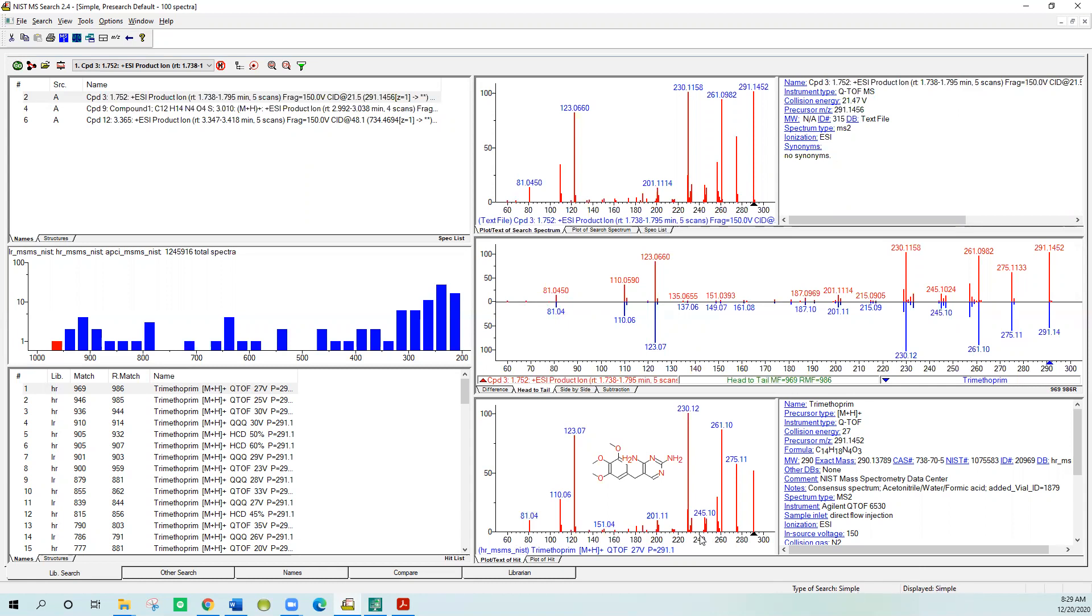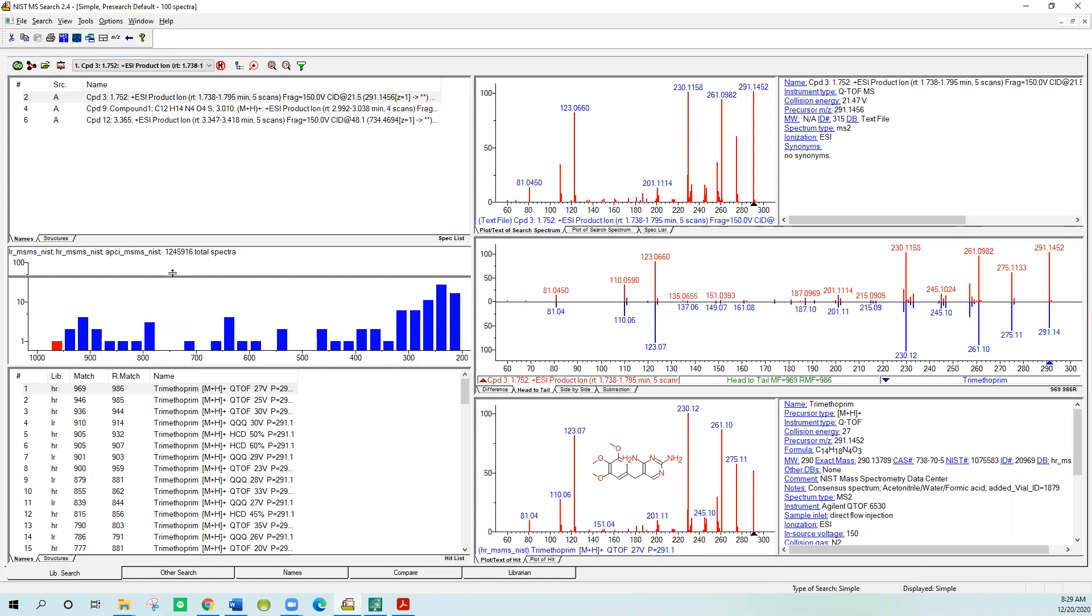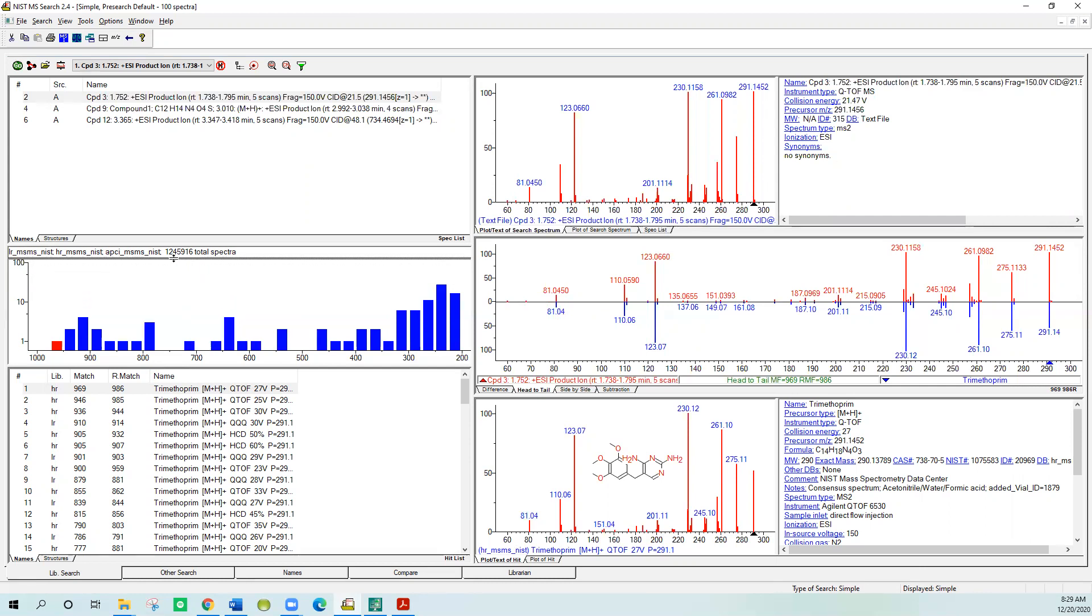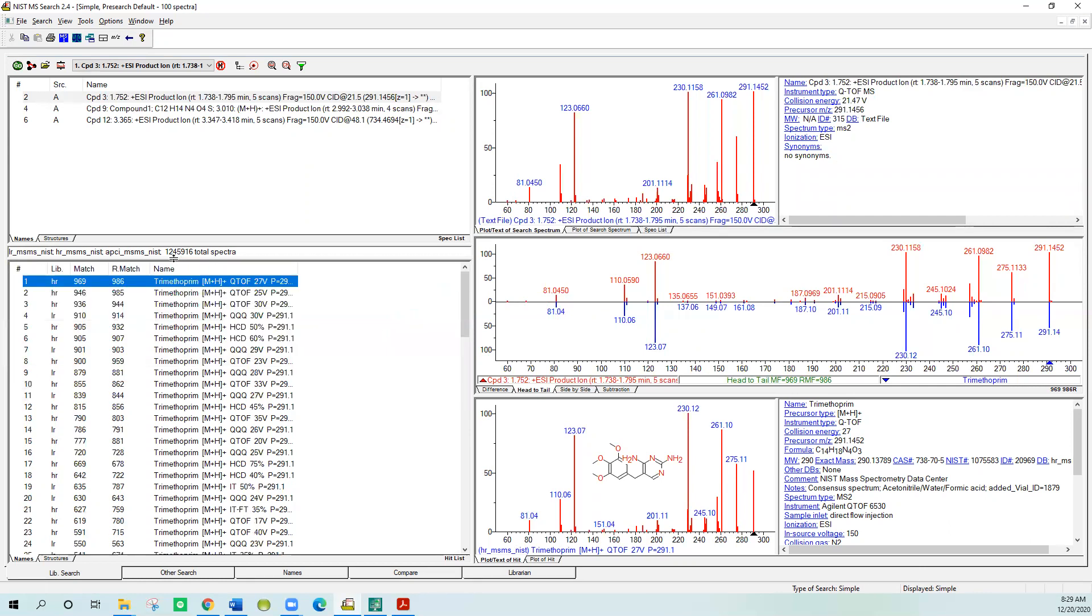It also tells you down at the bottom what type of search we're doing: a simple peak matching search. And this is what was run this time. So it tells you a lot of things. In the middle bar here shows you which libraries it searched: the low resolution NIST, the high resolution NIST, and the APCI NIST. Those are the three libraries that come with the NIST search software in version 2020. Also, I don't care much for the histogram, so I'll push this up out of the way. I've just grabbed it with my left mouse button. You can always refine any of these, and we talked about that in session one.